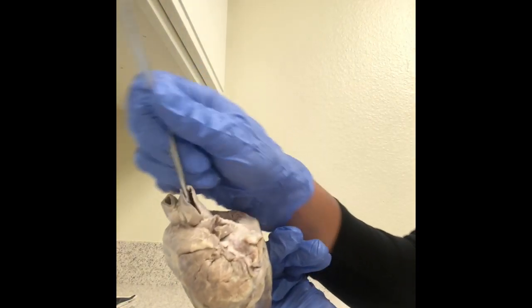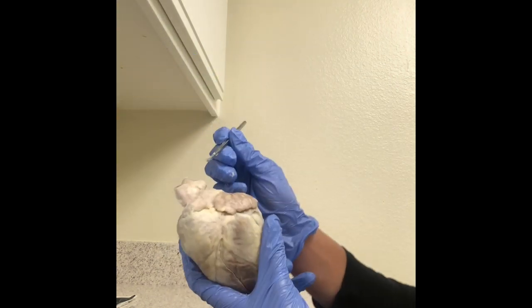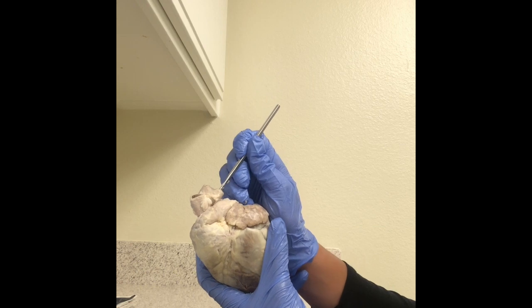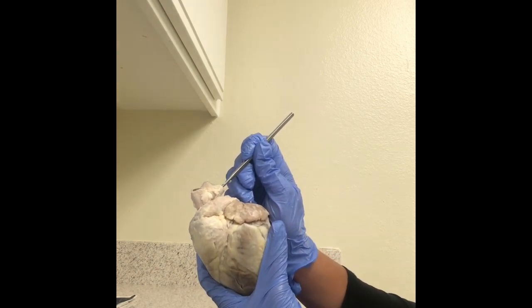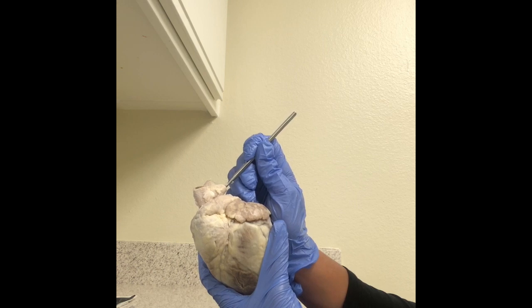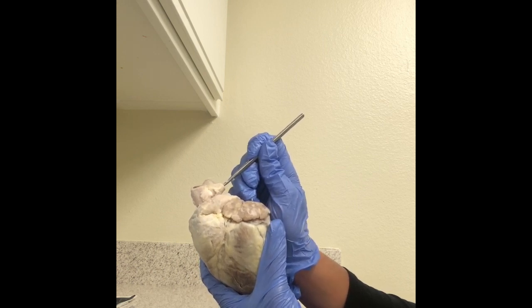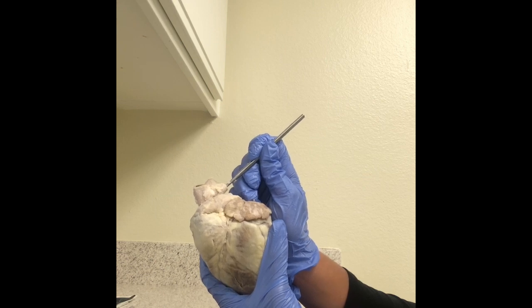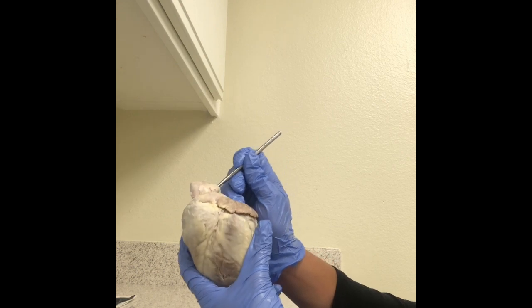So the aorta was one that I chose to identify. That is right there. The aorta is the main artery that carries blood away from the heart to the rest of the body. After the blood leaves the heart through the aortic valve, it travels through the aorta, making a cane-shaped curve that connects with other major arteries to deliver oxygen-rich blood to the brain, muscles, and other cells.